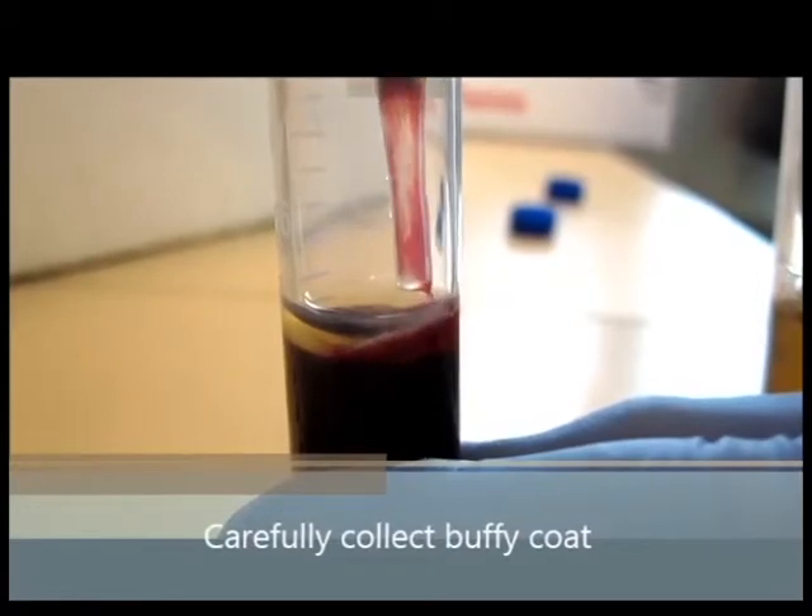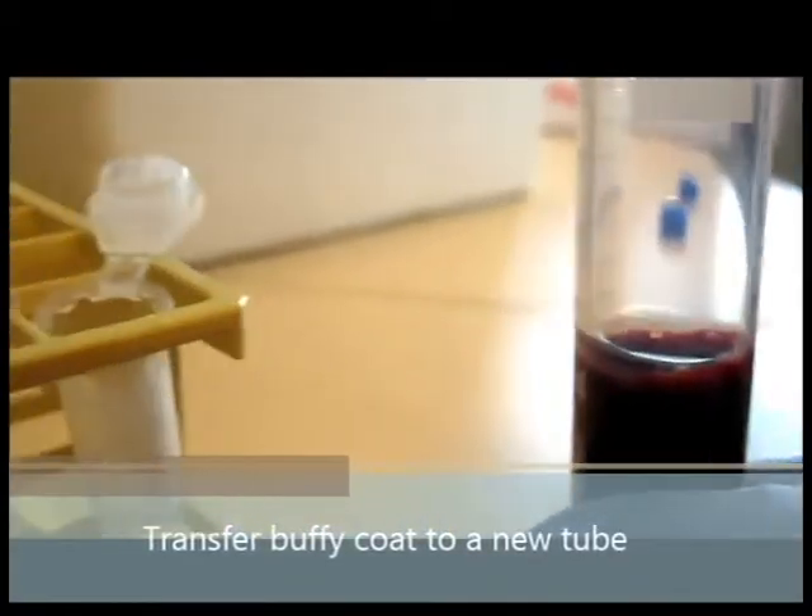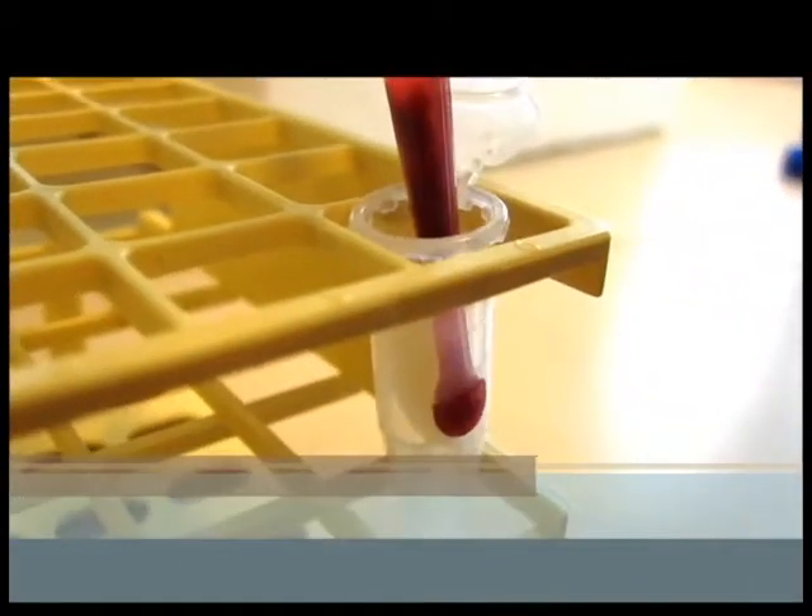Be careful when collecting the Buffy coat. Transfer the Buffy coat to a new tube.